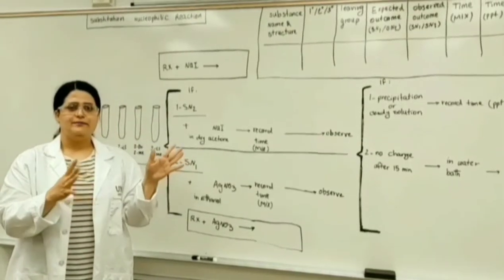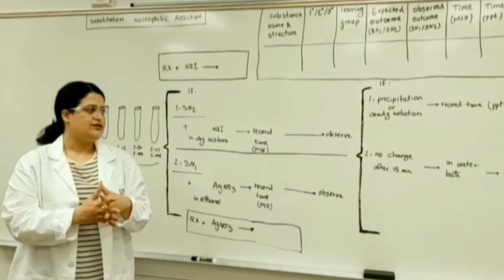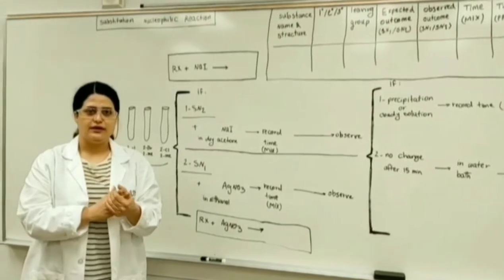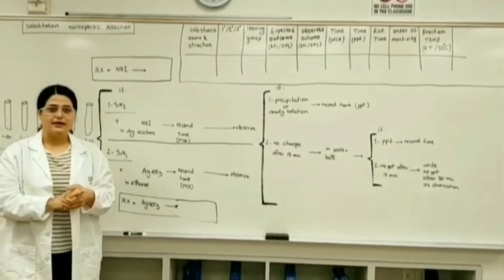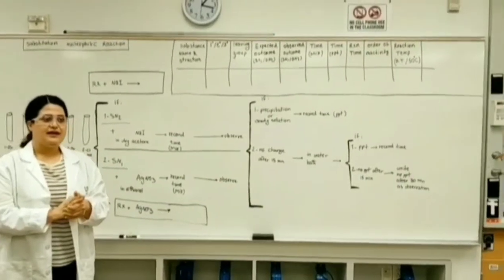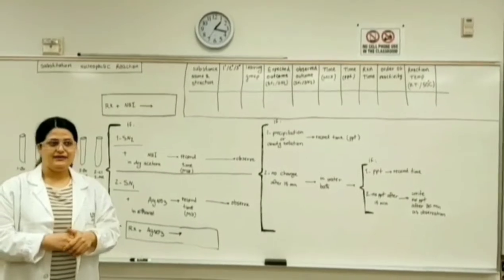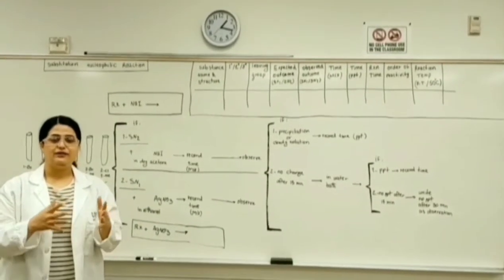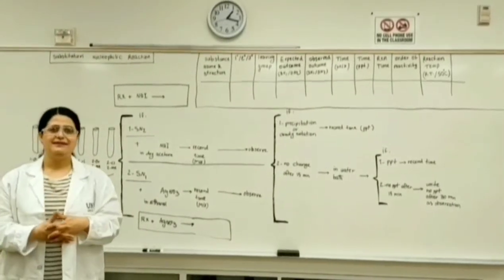You need to watch whole parts of the video and based on that, write your lab report. Along the way, I'm going to ask you some questions. These questions will be graded, so you need to answer them and write them on your lab reports in order to get full credit. Okay, let's go.